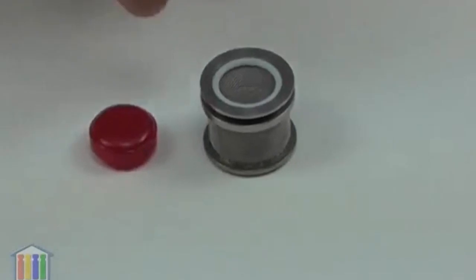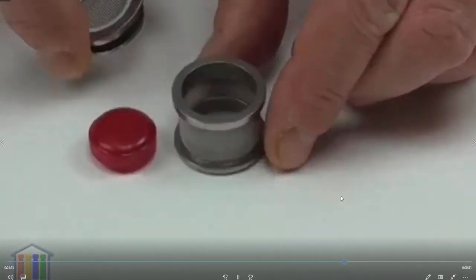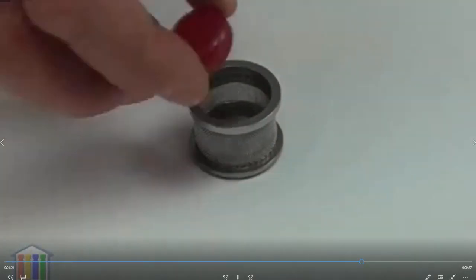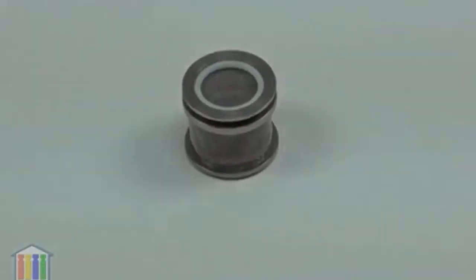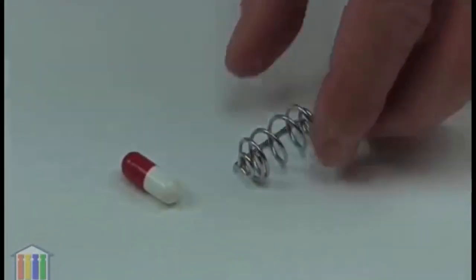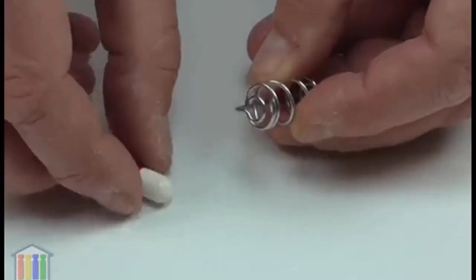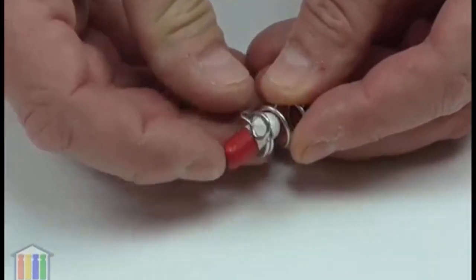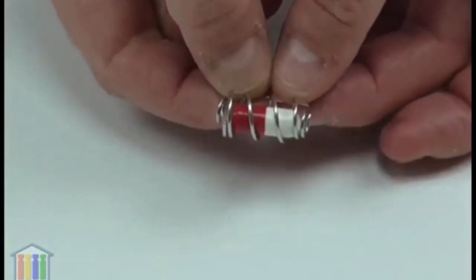This is the basket sinker. The basket sinker has a top that lifts off. These are designed for coin-shaped tablets, so you can take a tablet like this, drop it inside, and simply push the lid on. With the spiral sinker, the coil on the end moves to allow access to the sinker. So to put the capsule in, simply take the capsule, push the coil aside, and just simply push the capsule in. The coil flicks back into position and the capsule is held in the sinker.